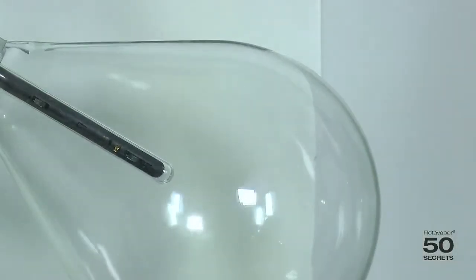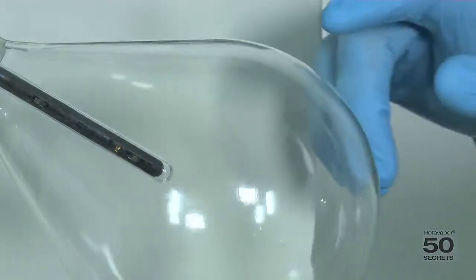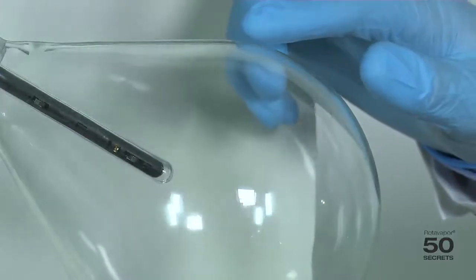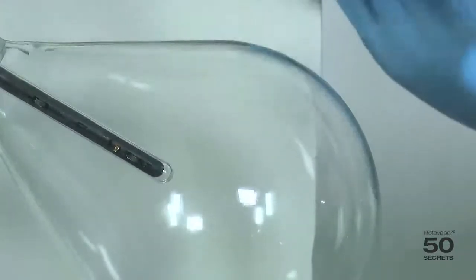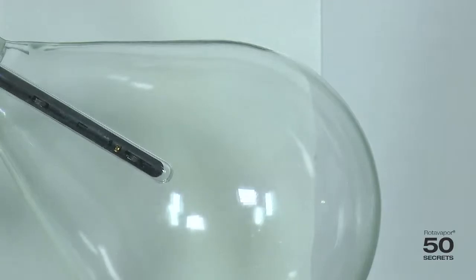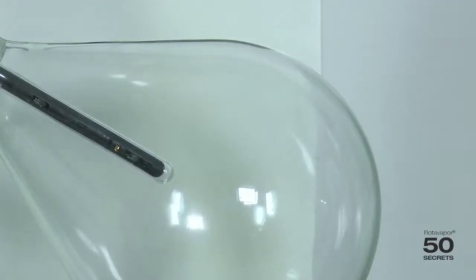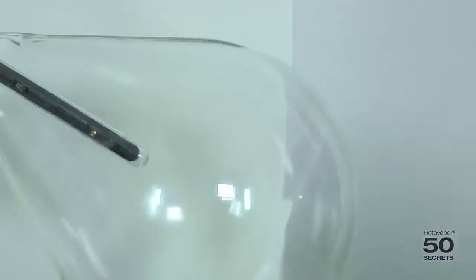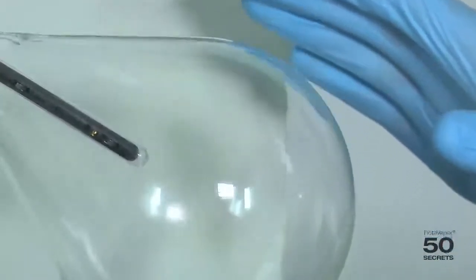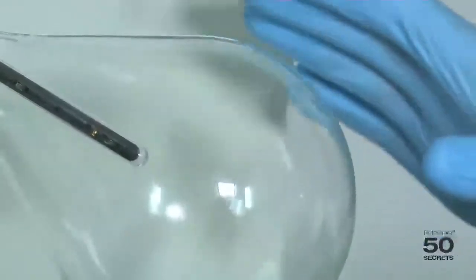Another quality property of the glassware we have is that the flask is very round — that means it doesn't wobble. You can see it's exactly precise, and if we compare it to other flasks there's a big difference. The impact of this is that the seal life will drastically decrease if you have a flask which is wobbling, as you can see with this flask we have a very big wobbling effect.